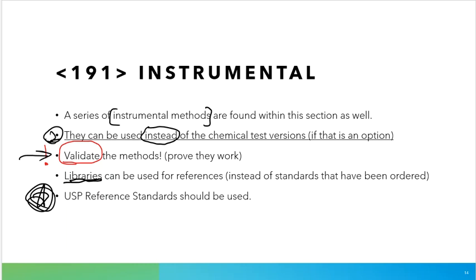They are very high quality. They are USP approved, and we will take that material, whatever that material might be. We will run that material or analyze that material in an instrument. We know that it should be present. It's been approved. It's been tested before I even receive it. And then that way we are ensuring, yes, we are using the highest quality standards that we can in order to validate our instrumentation and ensure that everything is going according to plan.